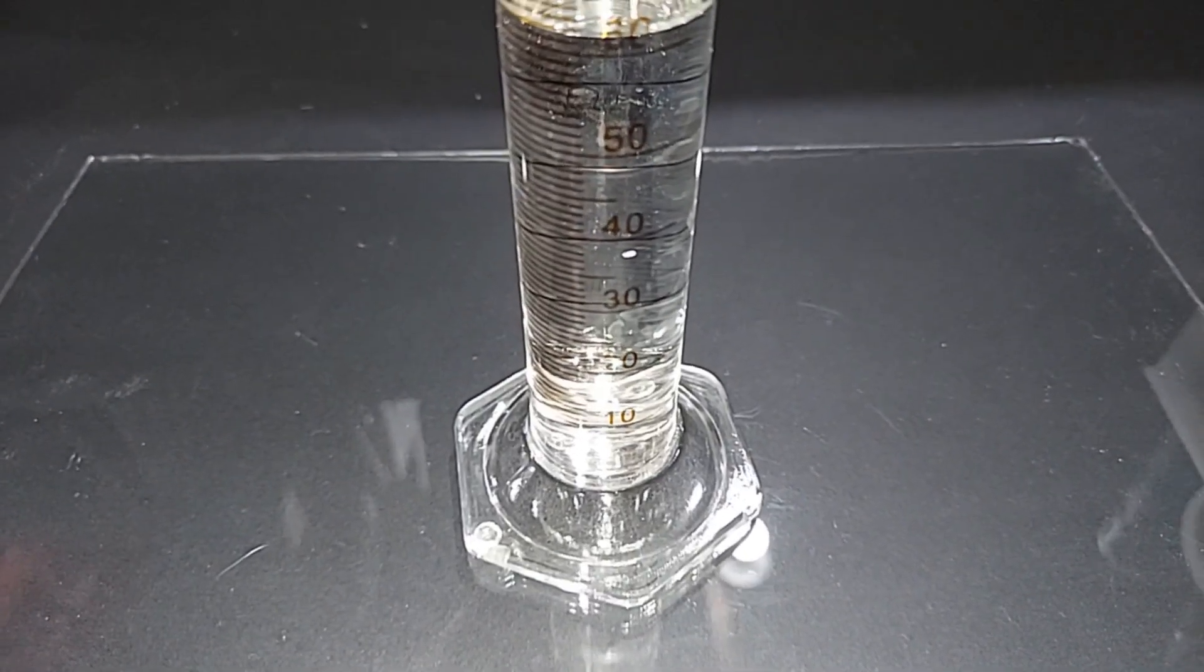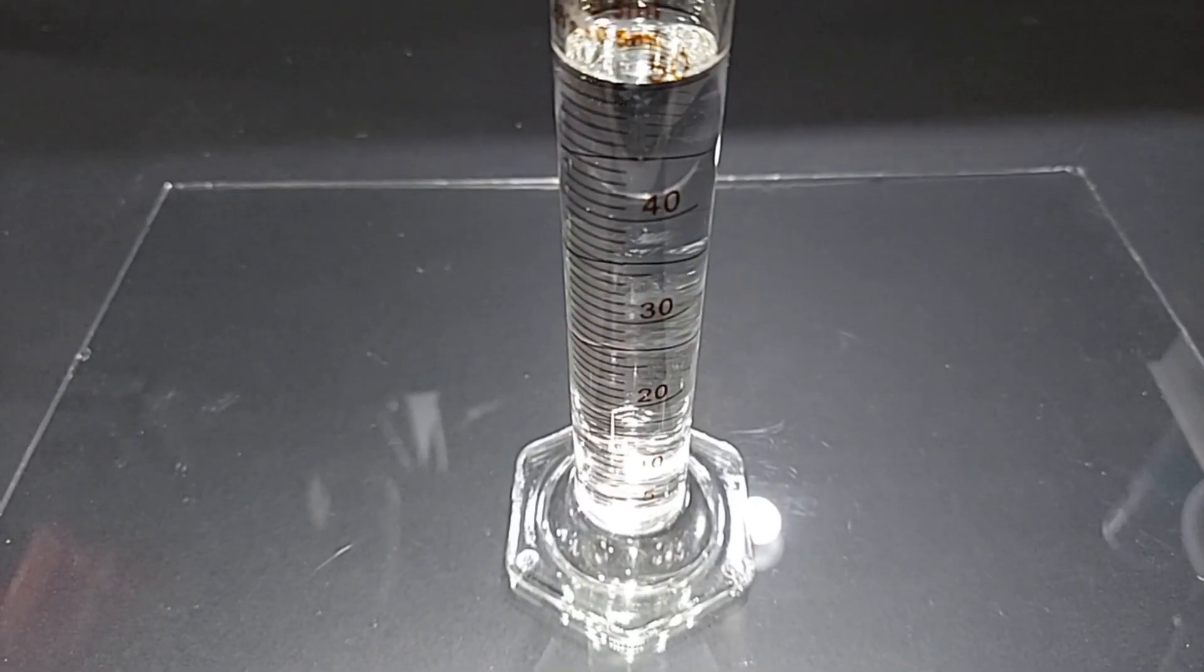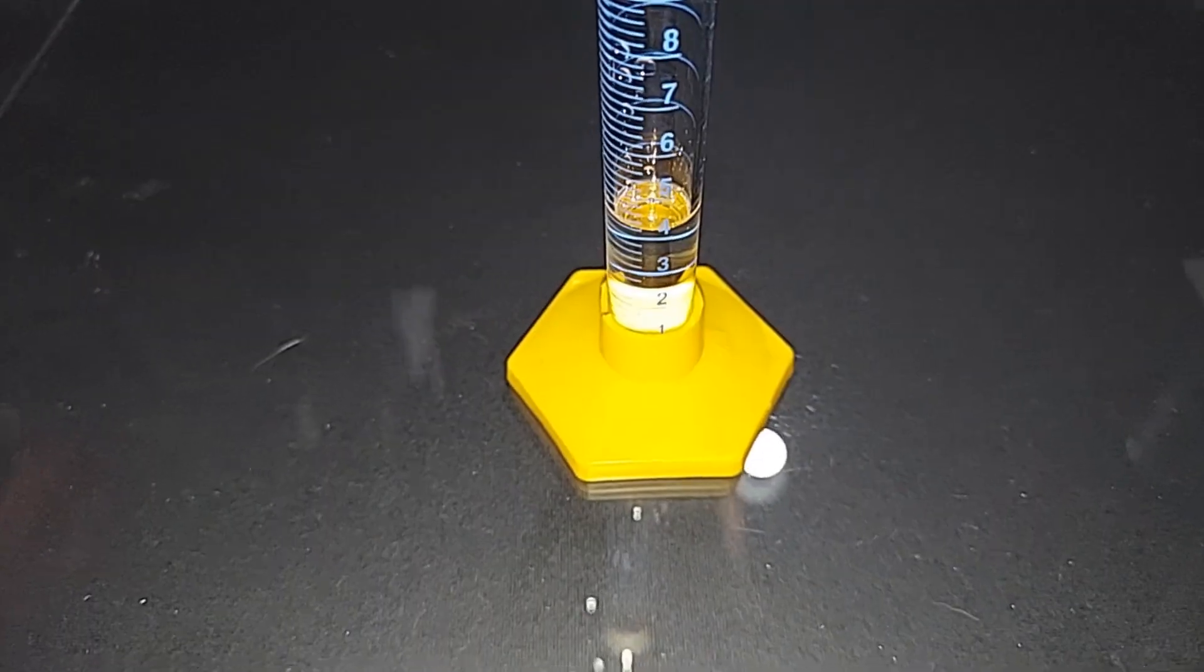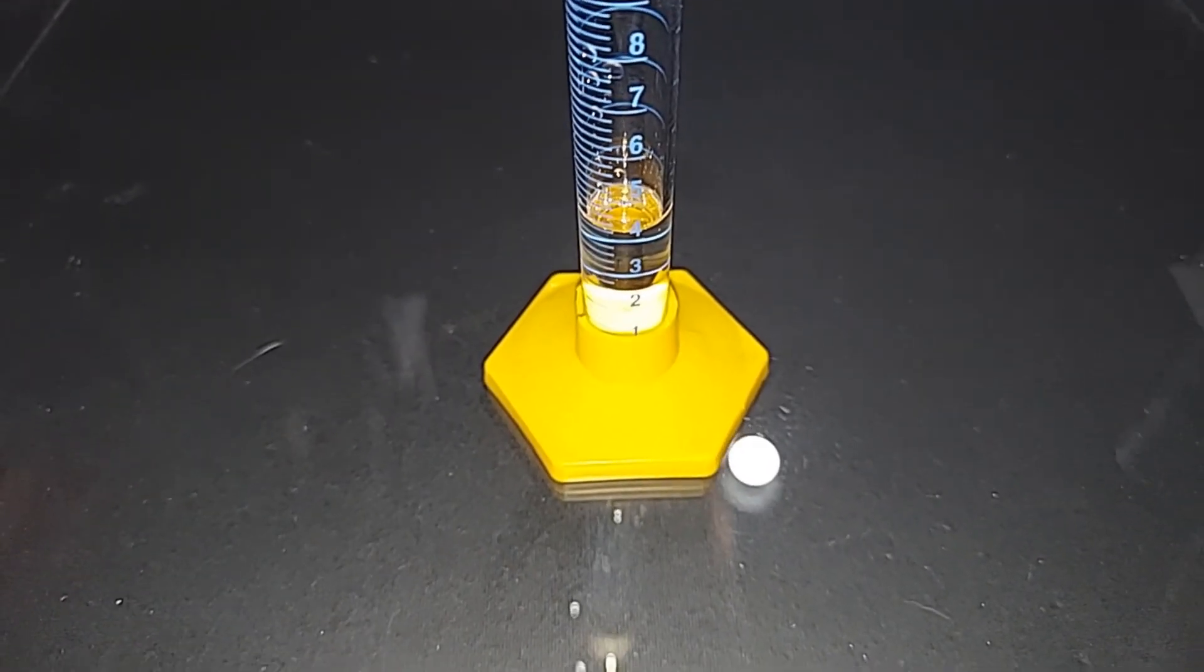60 milliliters of anhydrous ethanol, pre-measured. 50 milliliters of glacial acetic acid, pre-measured. 4 milliliters of 98% sulfuric acid, pre-measured.